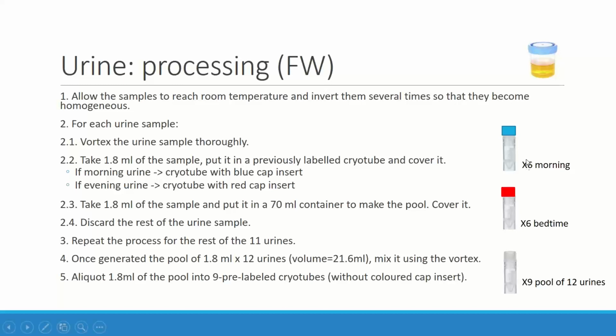They are not pooled. I say aliquots, but indeed they are different. And we are keeping them completely separately, because if somebody wants to check the variability of some chemicals during the different days, morning, night, we will be able to go to the samples and answer the question.